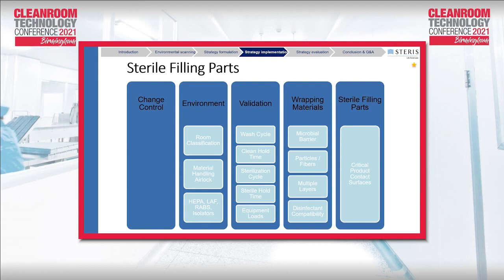And then we look also at the validation, for example, the validation of this washing cycle, the clean hold time, the sterilization cycle, the sterile hold time, and the equipment. And then again, it's not just this equipment that is critical, because there is the wrapping, there is the validation, but there is also the environment, room classification, the material handling, air like HEPA filter, etc. So the maintenance around those types of systems and material.